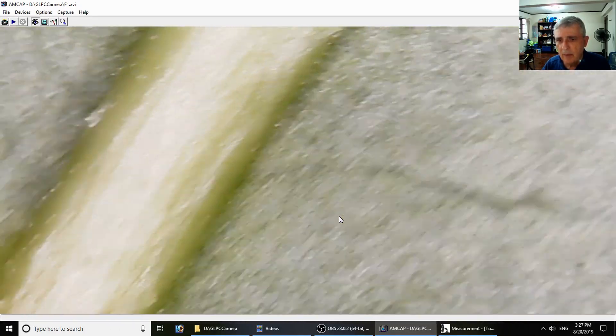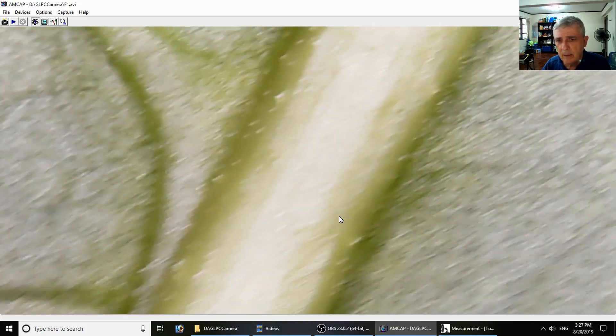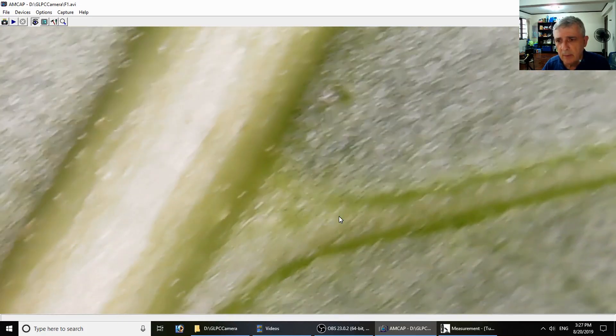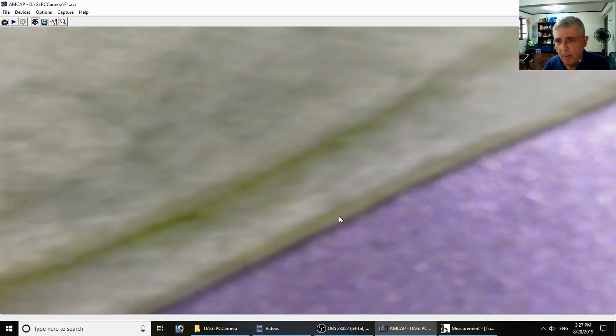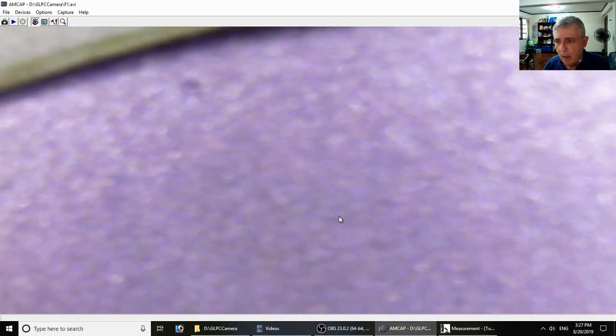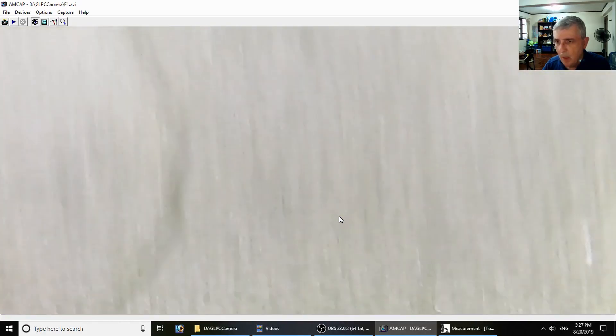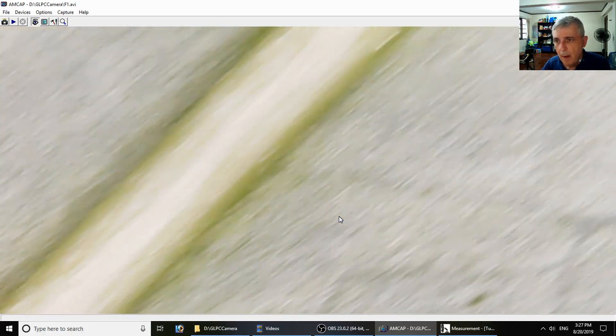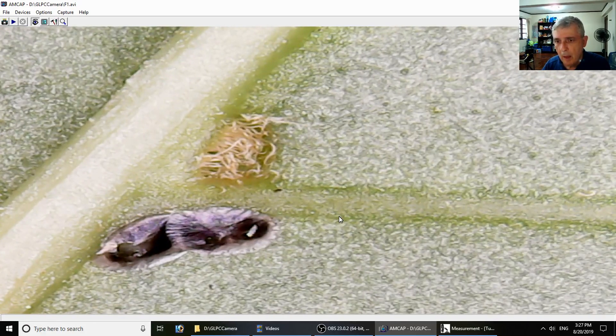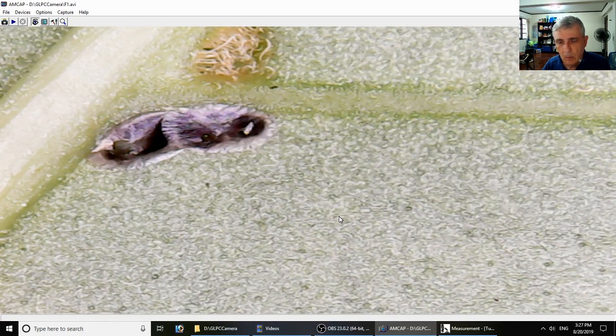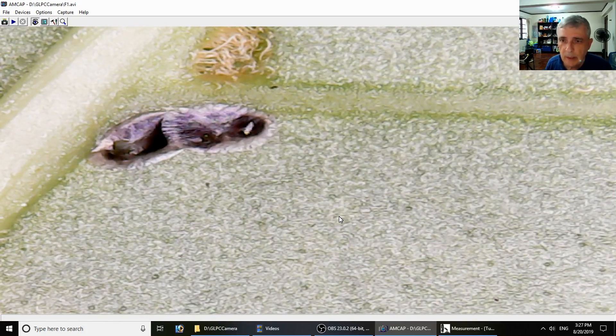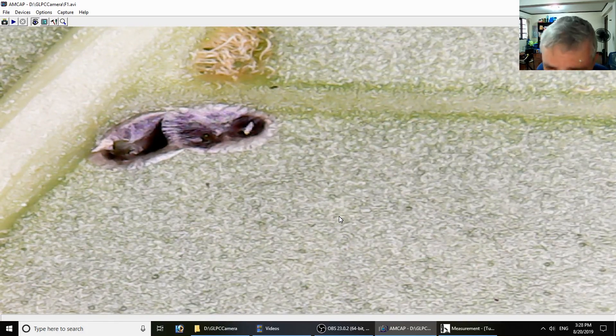Whatever's going on there looks like bugs or something. Yeah, there's some bugs.